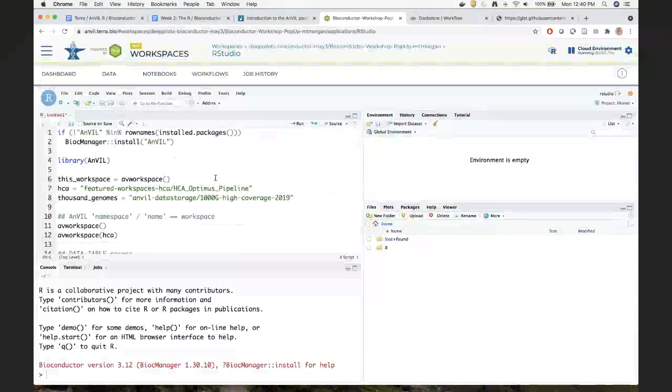And I'll just follow along with this a little bit. So I guess I just wanted to introduce, you know, in many ways, I can see I put way too much stuff into this pop-up workshop, but so we kind of got oriented, right, with the workspace.